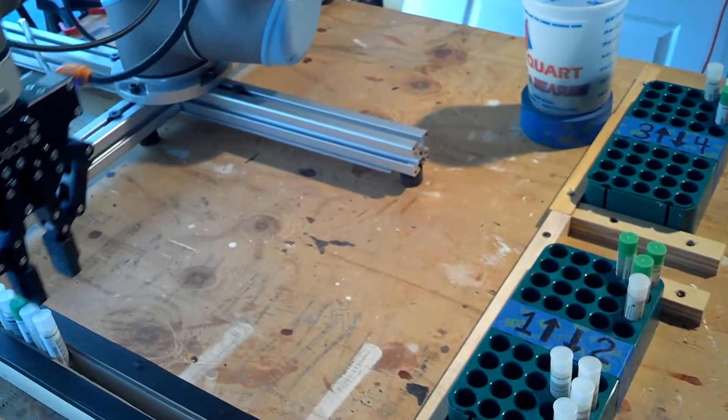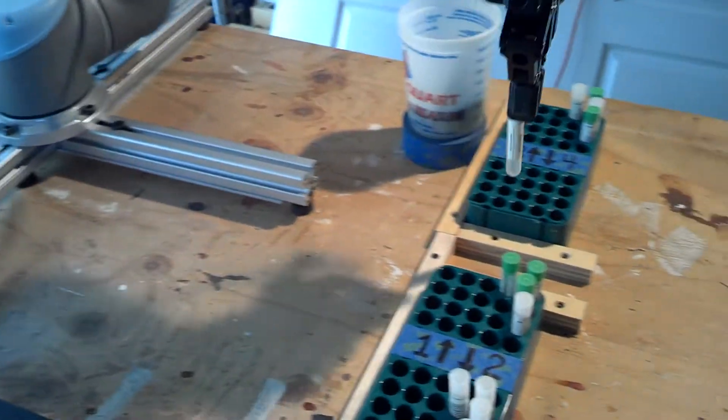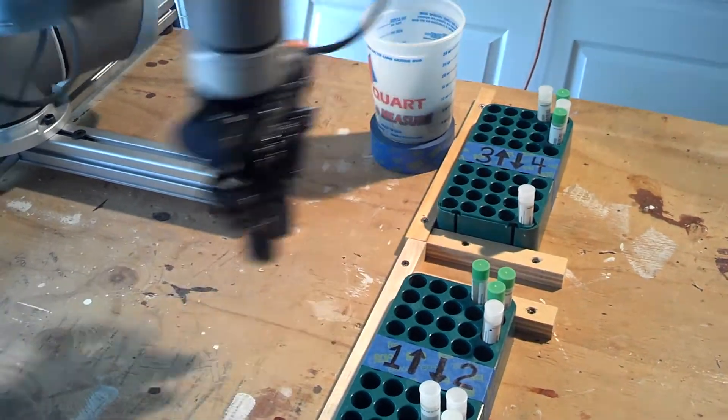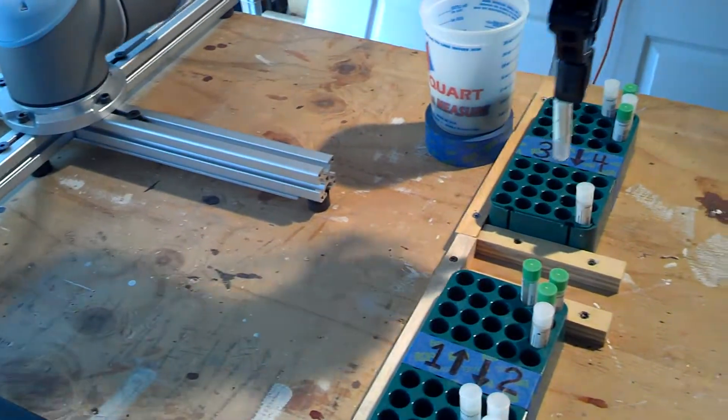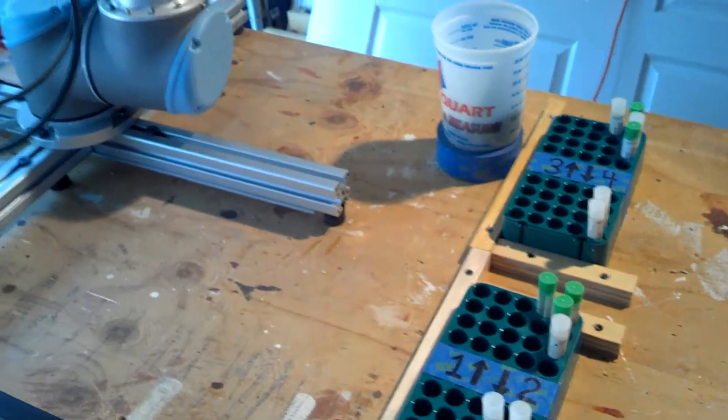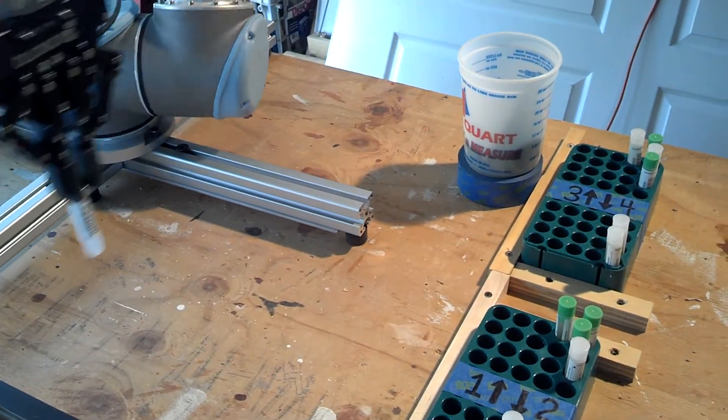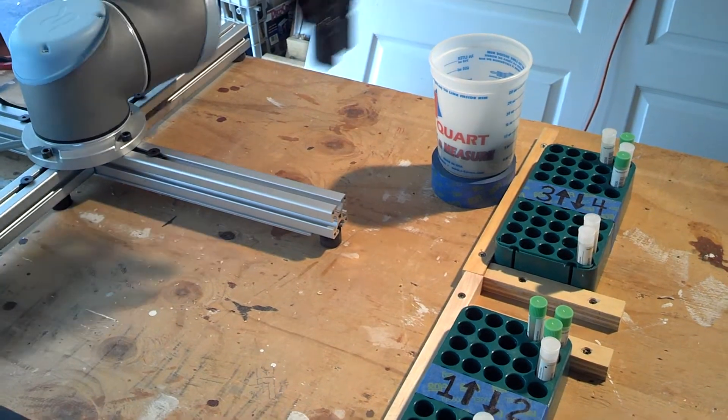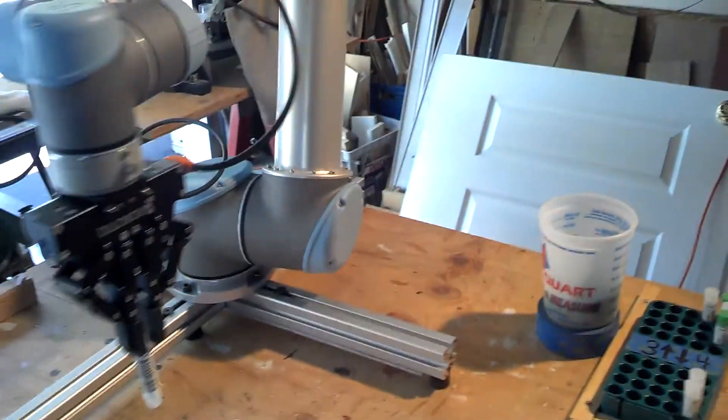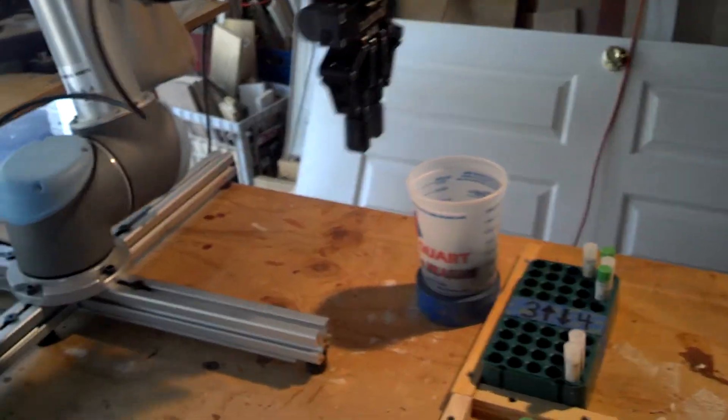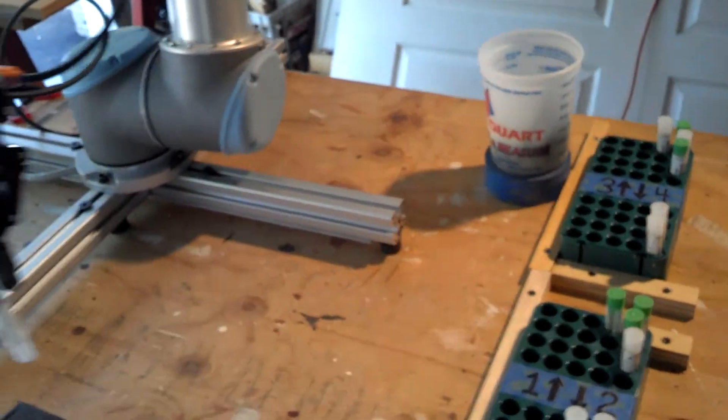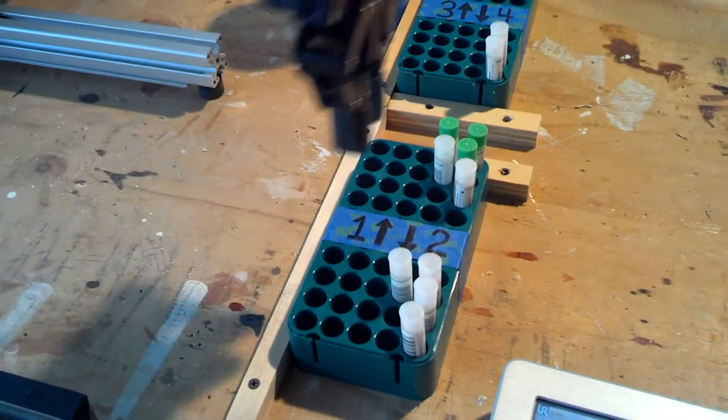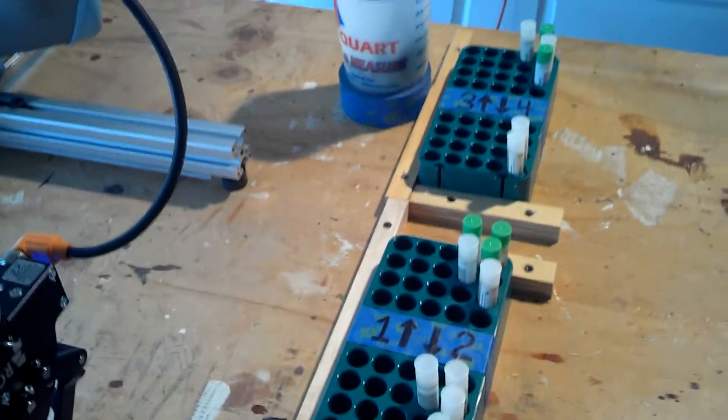So now I'll deselect that and select pallet four. Now I'll deselect that and select generic. Go back to the first pallet. That's it.